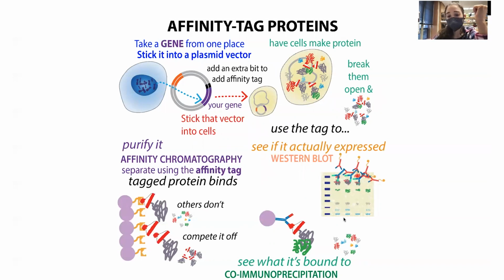You can do something similar with mass spec: you can pull out that protein of interest, either with an antibody against it or, if it's tagged, you can pull out the tag. Since you're isolating that protein specifically, what you're sequencing is going to be that protein and anything that's bound to it, although this binding might not be direct. So these are important things to keep in mind, and why it's important to then further characterize the interaction in vitro and see if they really are interacting.